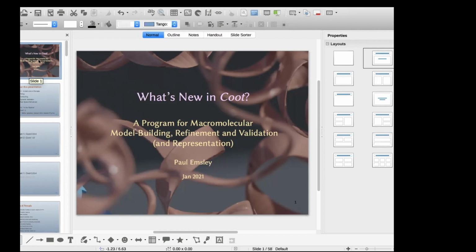And so let me try to remember what the file format is. I think it's OBJ. Mm-hmm. Yeah, that's what they listed here, OBJ or .ply. Yeah.